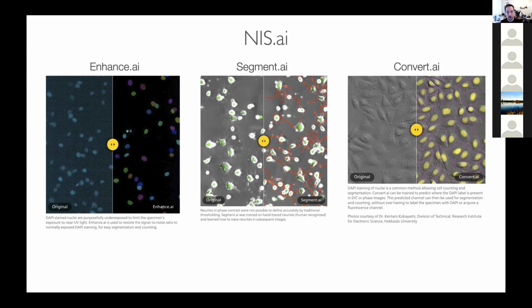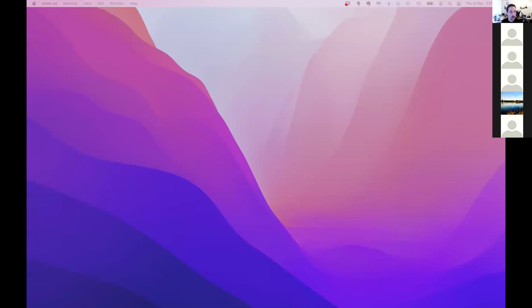And so with that, I wanted to stop, and then we'll remote into the workstation at the Zuckerman Institute. Can you just clarify quickly, the Elements, you were saying that we're using open source software mostly, but Elements isn't. Yeah, Elements, that's right. So paid for, right? Exactly.